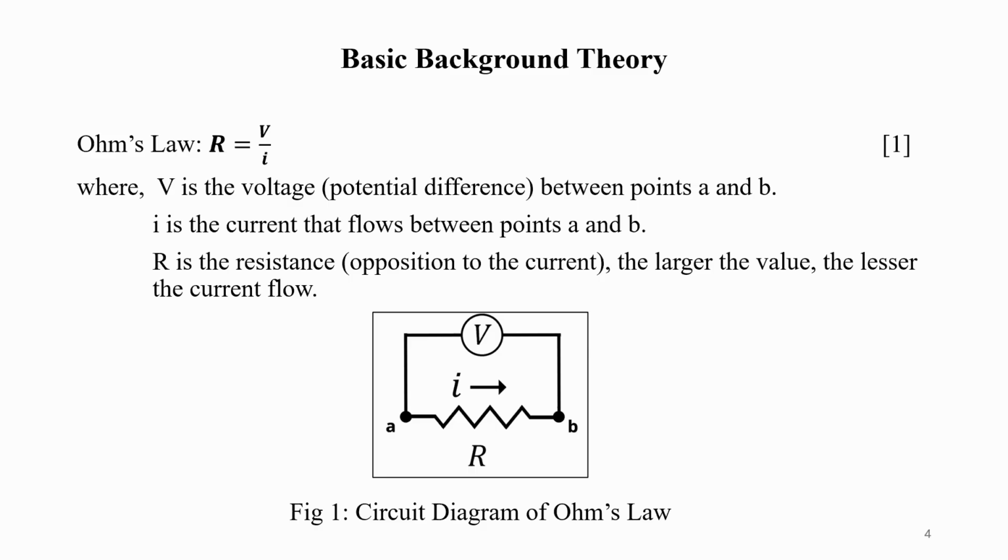Because of that, we can't just use simple resistance. We need a new quantity called impedance, which includes both the magnitude of resistance and the effect of phase shifts between voltage and current. In EIS, both voltage and current are written as functions of frequency because the response of a system changes depending on how fast the signal oscillates. Next, please.